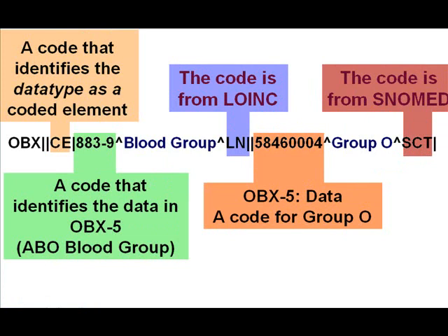The individual result names can be used as the result, or it can be used as the ordering name. So you get kind of full meaning by knowing that this code is the thing inside of an order, or it's the thing inside of a result record. So we use the same codes as order codes and as result codes.